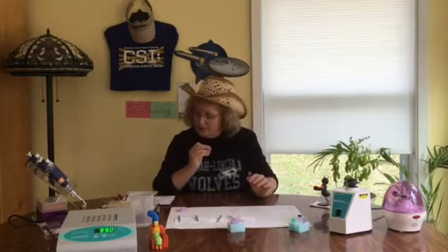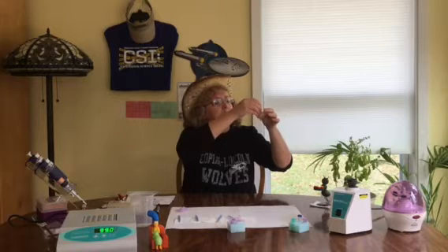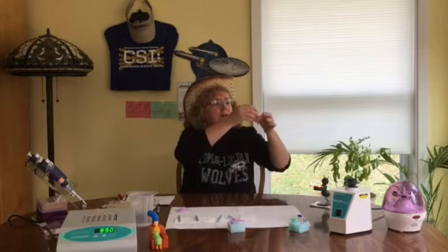These are the macerators that you made in the beginning of the rodeo. So find the insect and use your macerator to pin that insect to the wall and just scrape it and try to break the exoskeleton into as many pieces as possible.